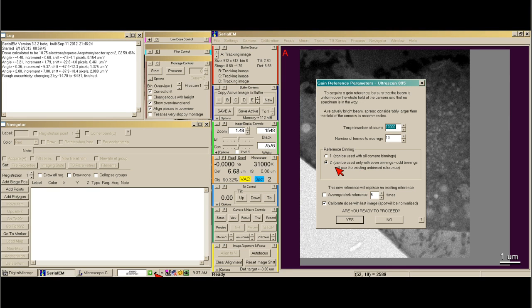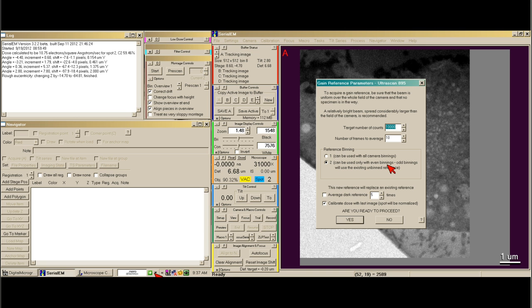We usually use our 4K camera at 2K, so we just do our reference binning at 2. This means it can only be used with even binning images.